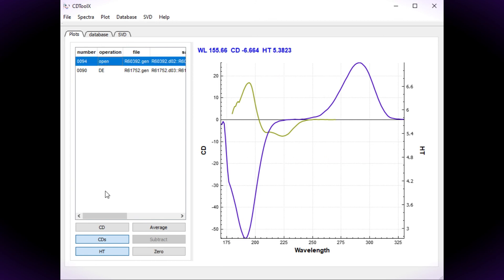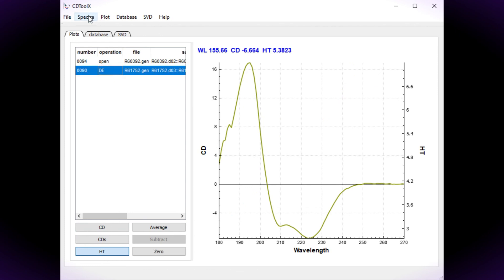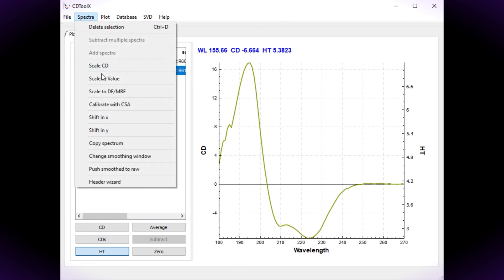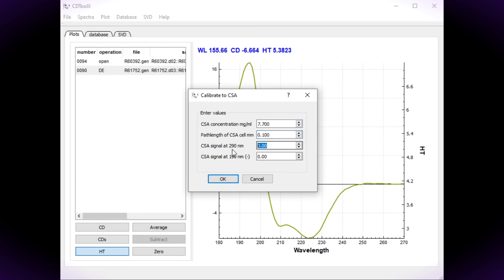Select the spectrum and choose Calibrate with CSA from the spectrum menu. In the dialog box enter the concentration of the CSA, the path length of the cell used and the two peak values. Note the 192 value must be negative.